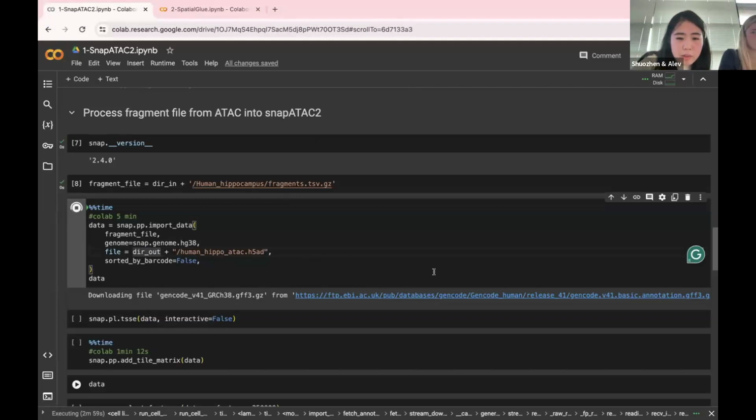Colab did not open by default. Yeah, if the Colab does not open automatically for you, you can search Colab and log into it first. And from that, you can copy the script into your Drive folder, and it will open it as Colab.